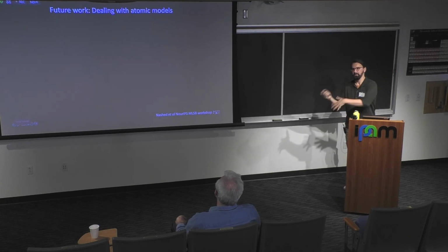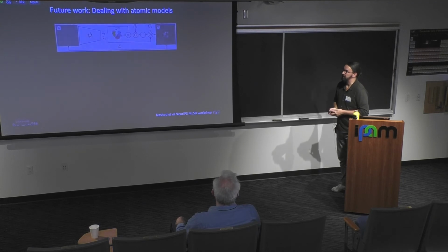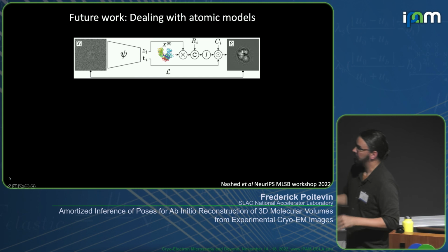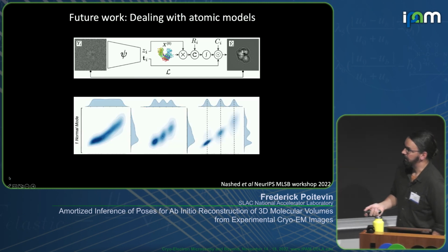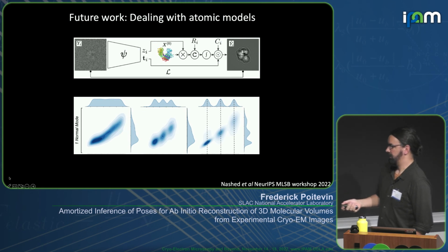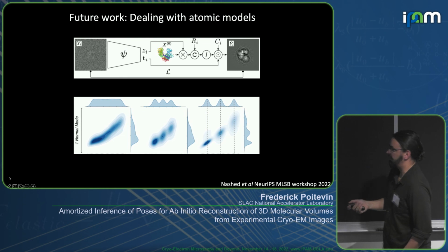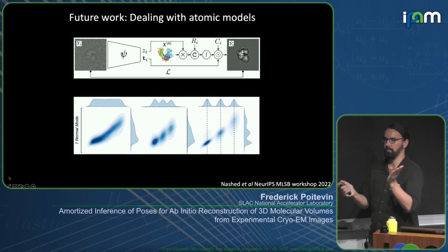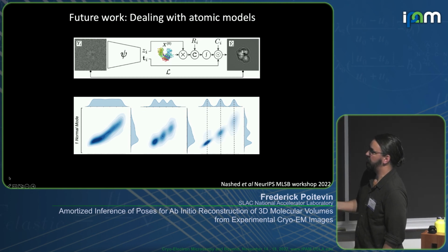You've heard about atomic models or Gaussian mixture models coming in place, so we started to look into that direction. Just as a very short story, we have a little white paper on how we could use normal mode analysis for this. As a little illustration, we had these 3 different datasets that we generated. Basically, it's a transition across 2 conformations of a small protein. And we sampled 3 different distributions here. This is the ground truth.